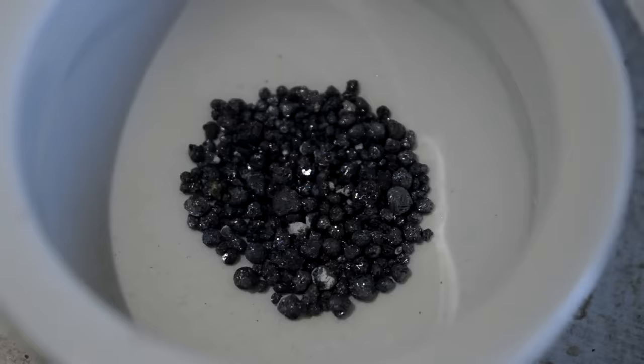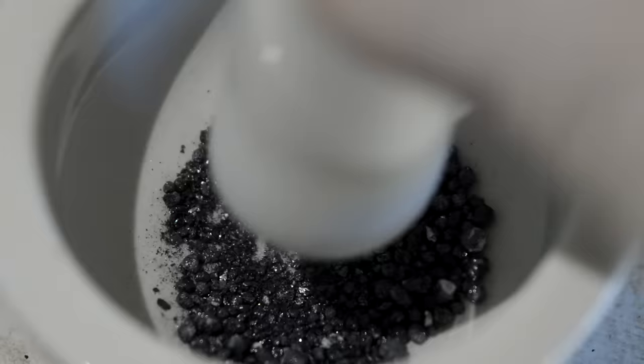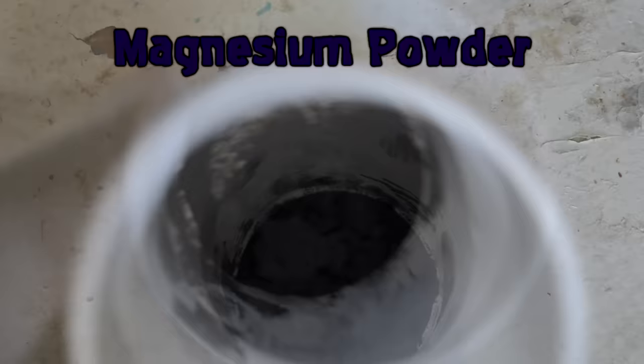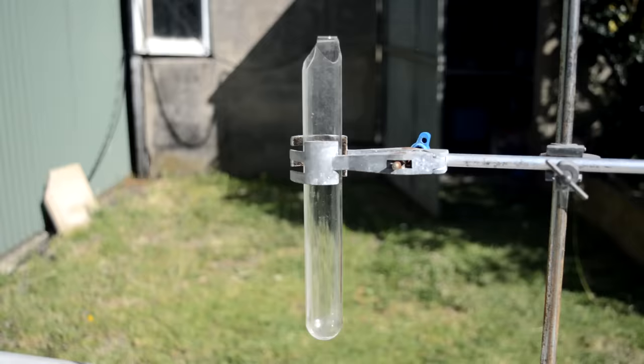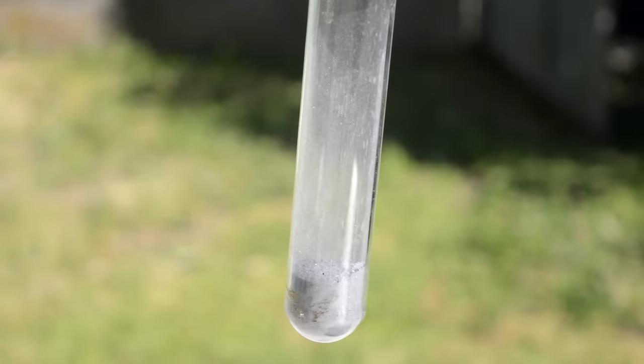We grind it up - we want it to be really fine to react with the magnesium. We also want to add something else in there so the whole reaction proceeds a bit faster, so I added a little bit of elemental silicon and also a little bit of silicon dioxide. The silicon dioxide will drive the reaction forward and generate a lot of heat with magnesium. We load our product into our least favorite test tube, then cover the top with sand to stop the magnesium from reacting with the air preferentially. We want it reacting with the silicon dioxide and silicon metal in the test tube.